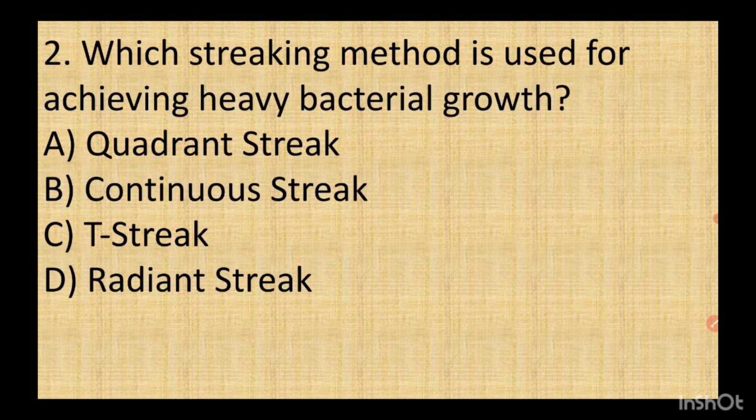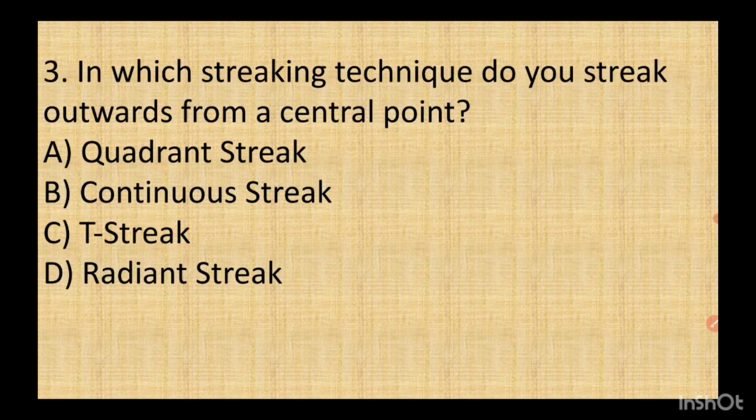Which streaking method is used for achieving heavy bacterial growth? Correct option is continuous streak. In which streaking technique do you streak outwards from a central point?